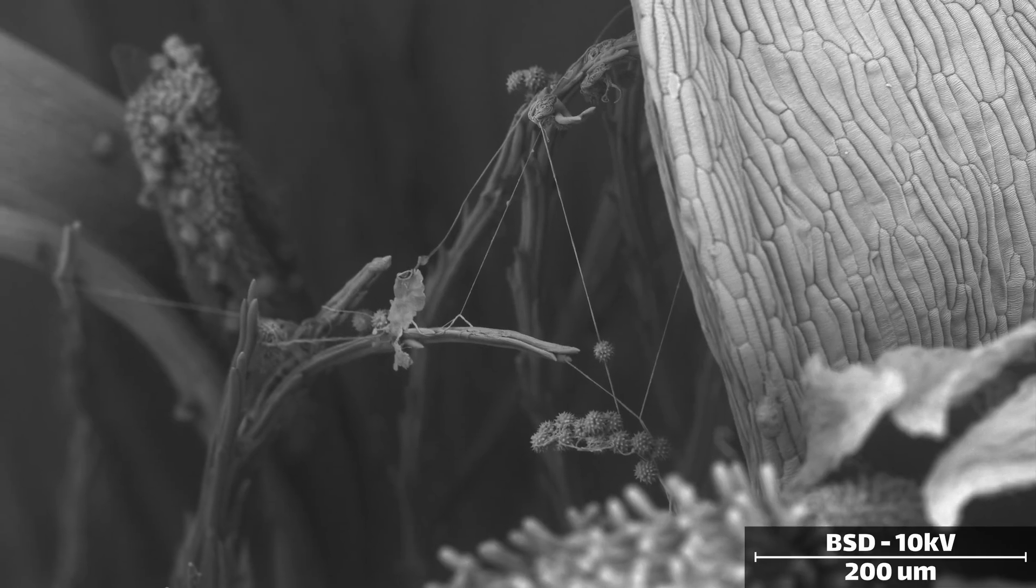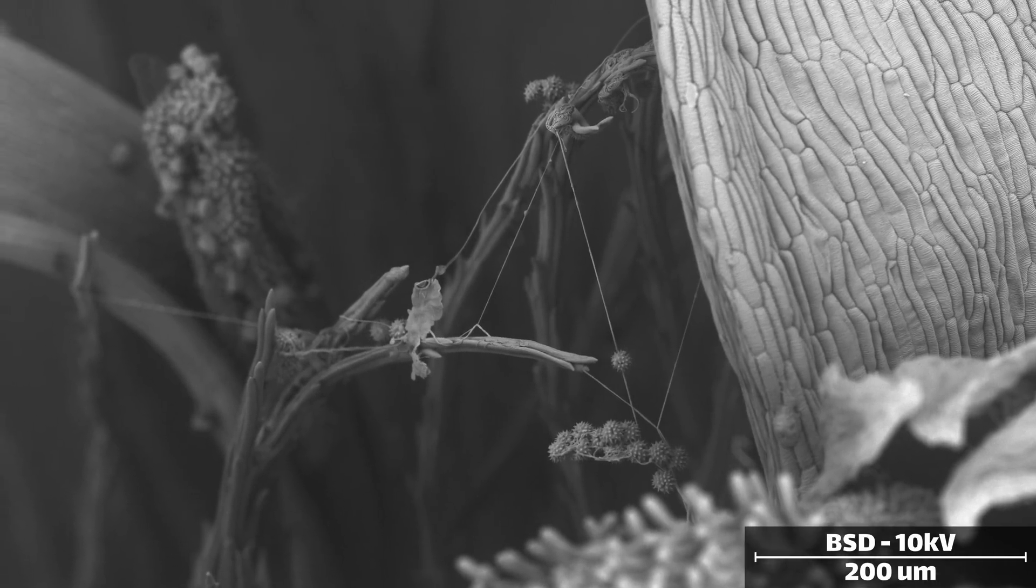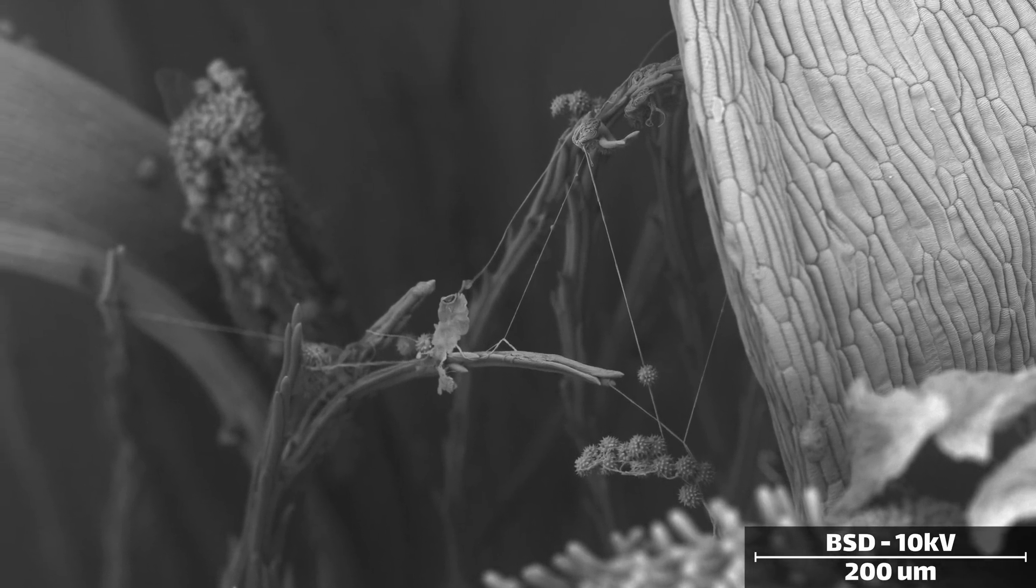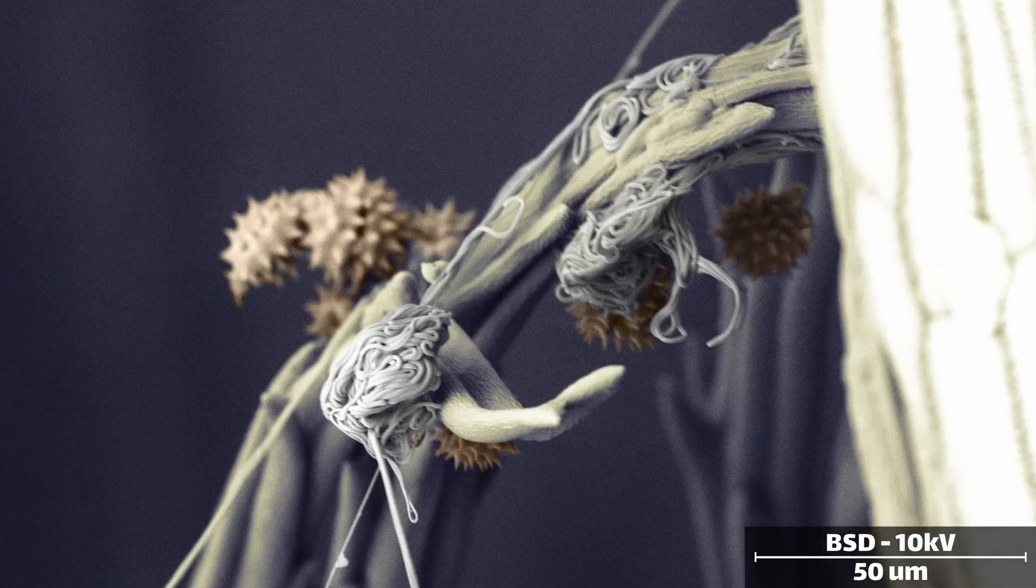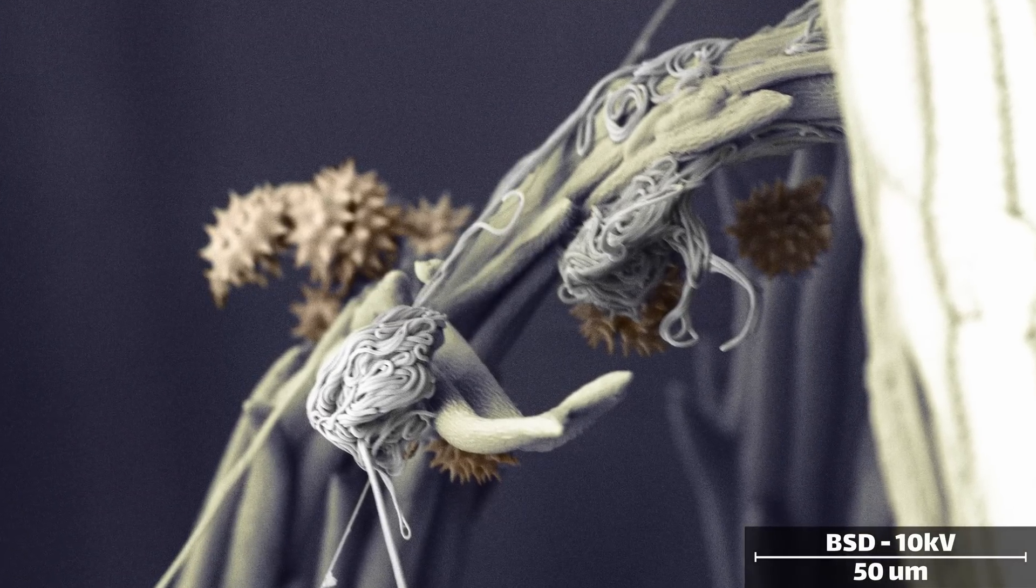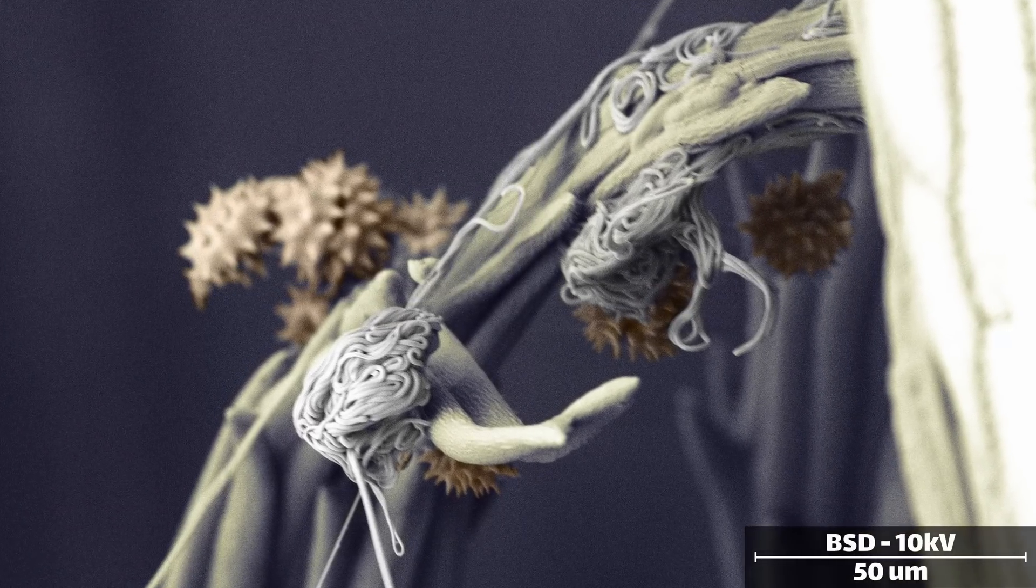Finally, the best part about microscopy is that you often find unexpected surprises. Here is a ball of spaghetti. Well, it's more likely spider silk, which has caught a bunch of pollen instead of insects.